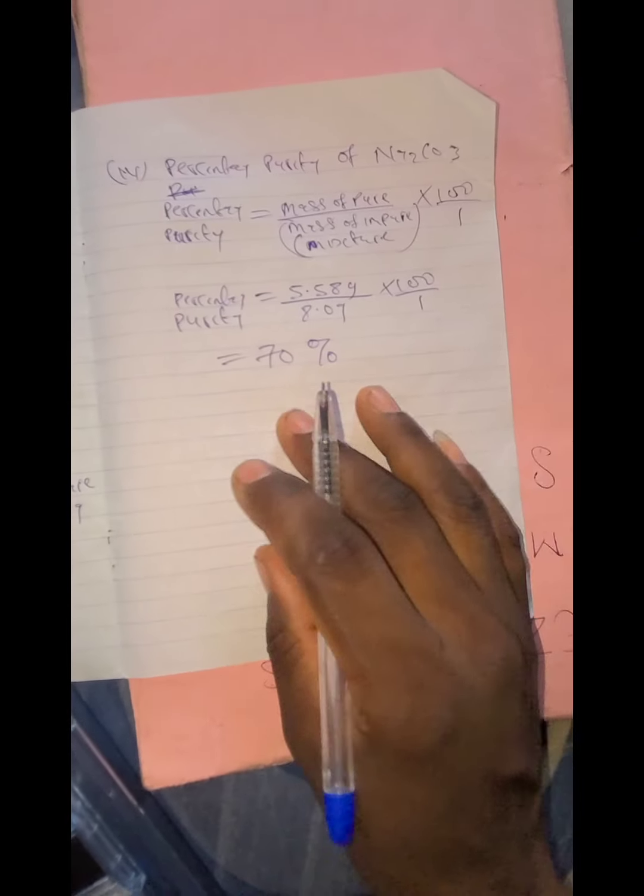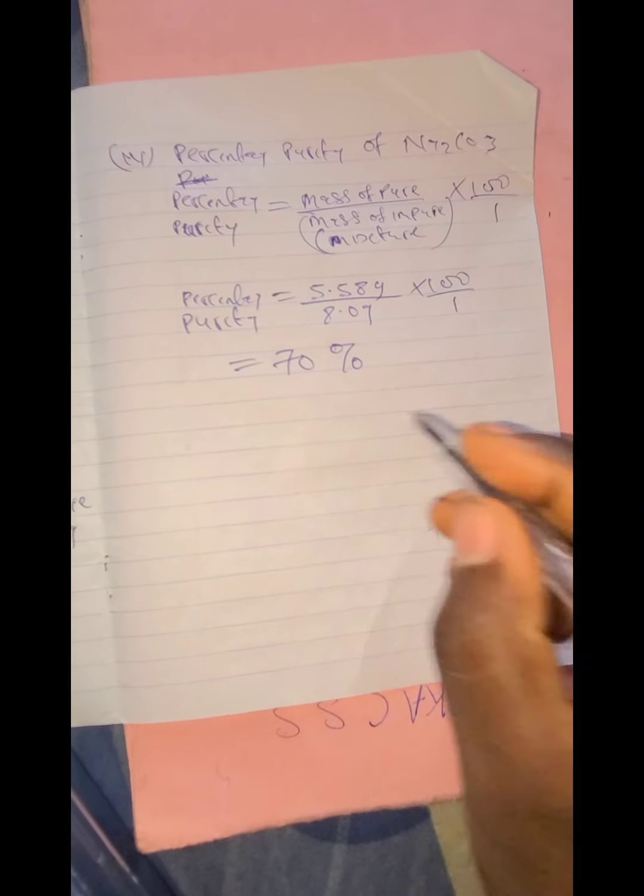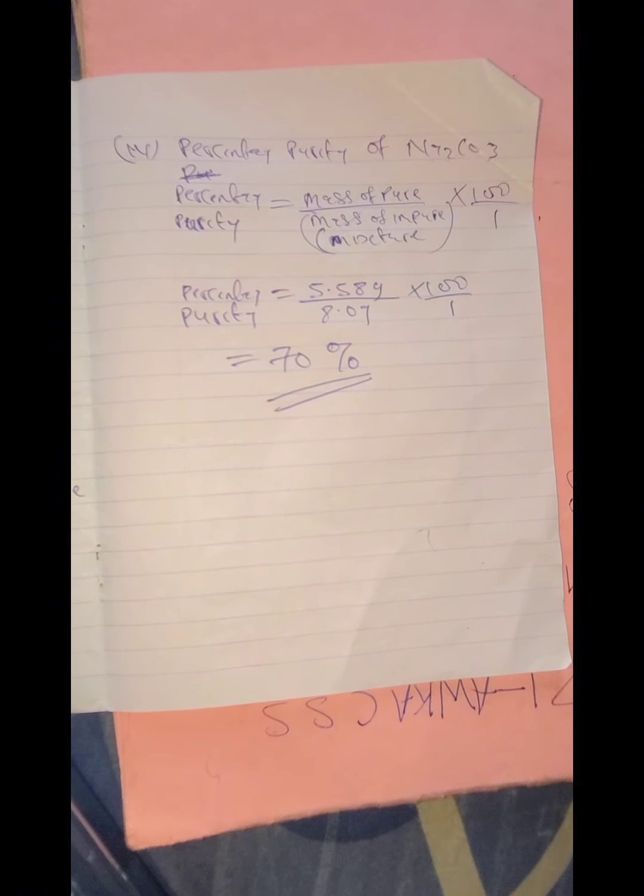Please don't forget to put your percent because you are looking for percentage purity. Okay, that's your percent, don't forget that.